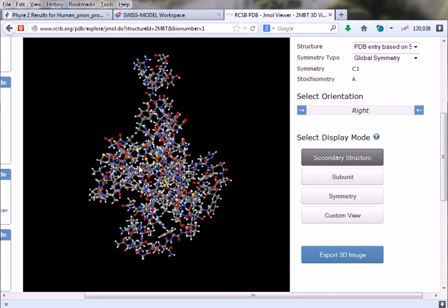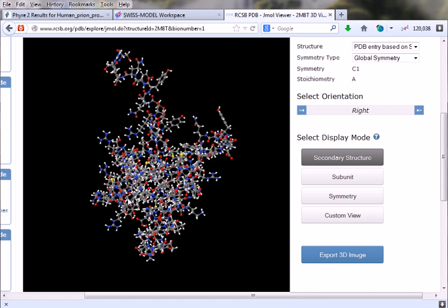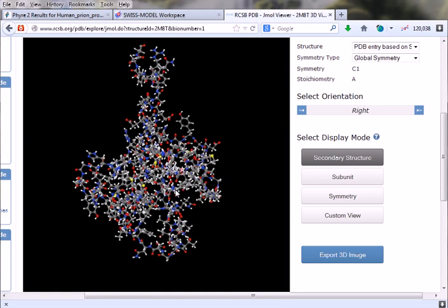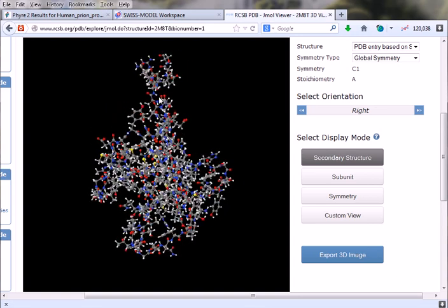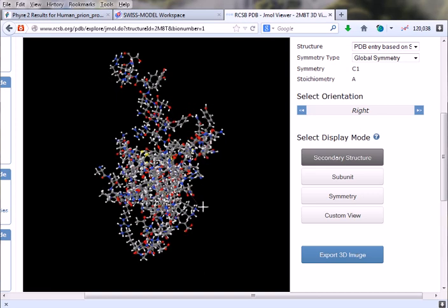Double click. So let's say we will measure from this yellow one till this one. So from this one, say this one, it is giving us the measurements. As you can see, it is telling us the distance between these two atoms is 22.32 angstrom. Simply by clicking twice and then clicking here, it will give us the measurement.